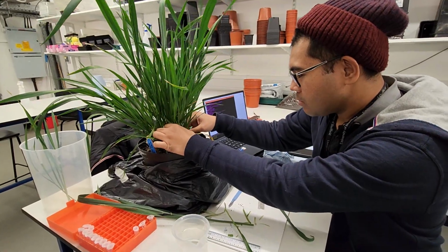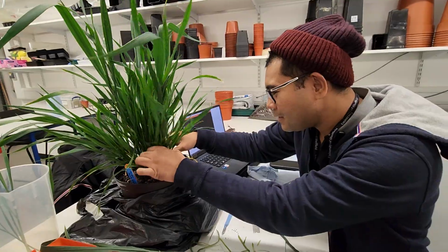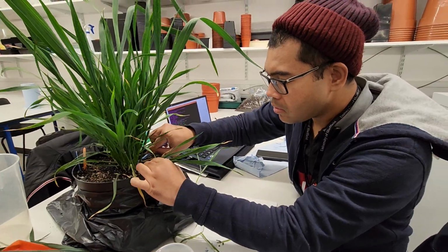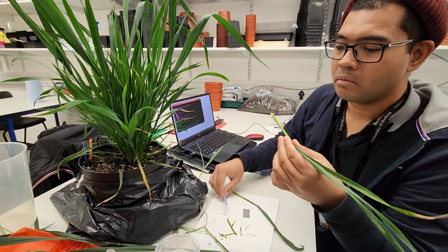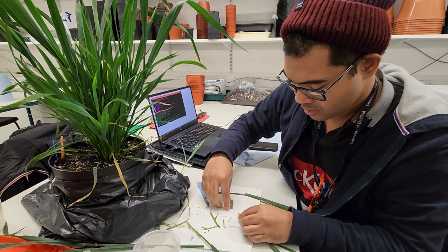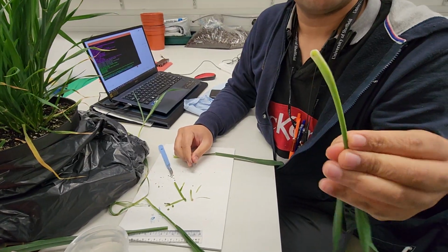Interesting. I think this video cannot be used, because it has already undergone stem elongation. Last week when I took it, it didn't have it yet. Let's try again. No stem elongation? No.